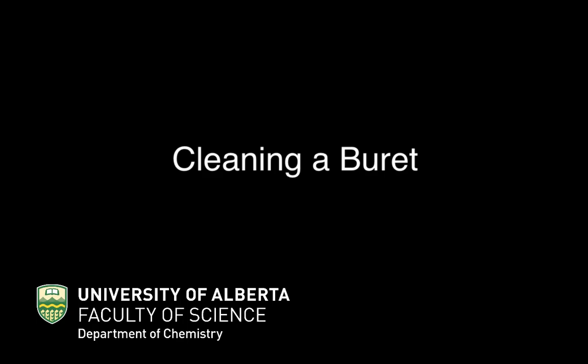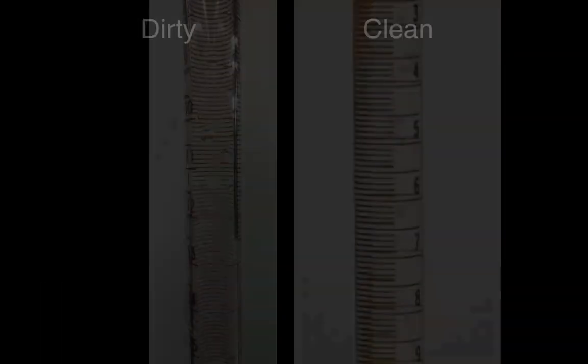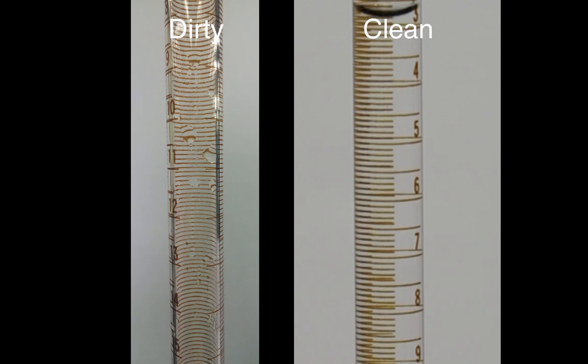Cleaning a burette. Before use, rinse the burette with deionized water to verify that it is clean.